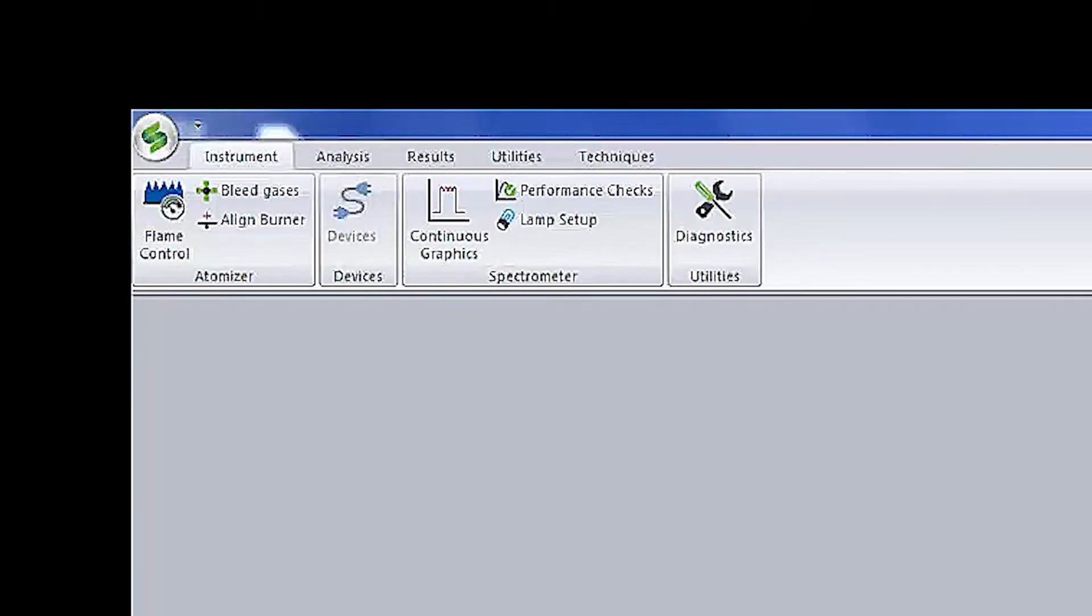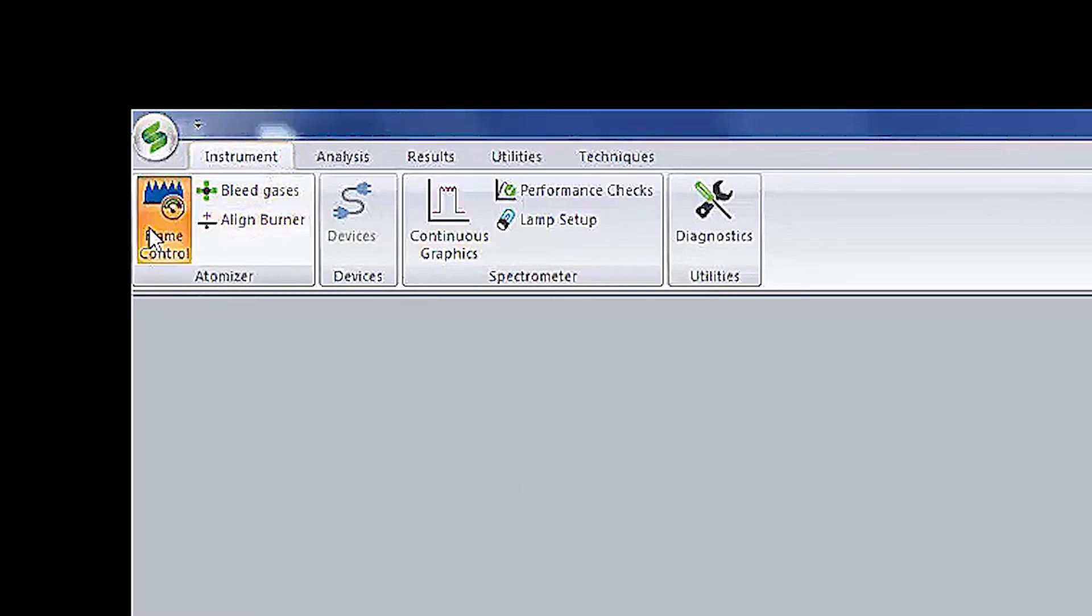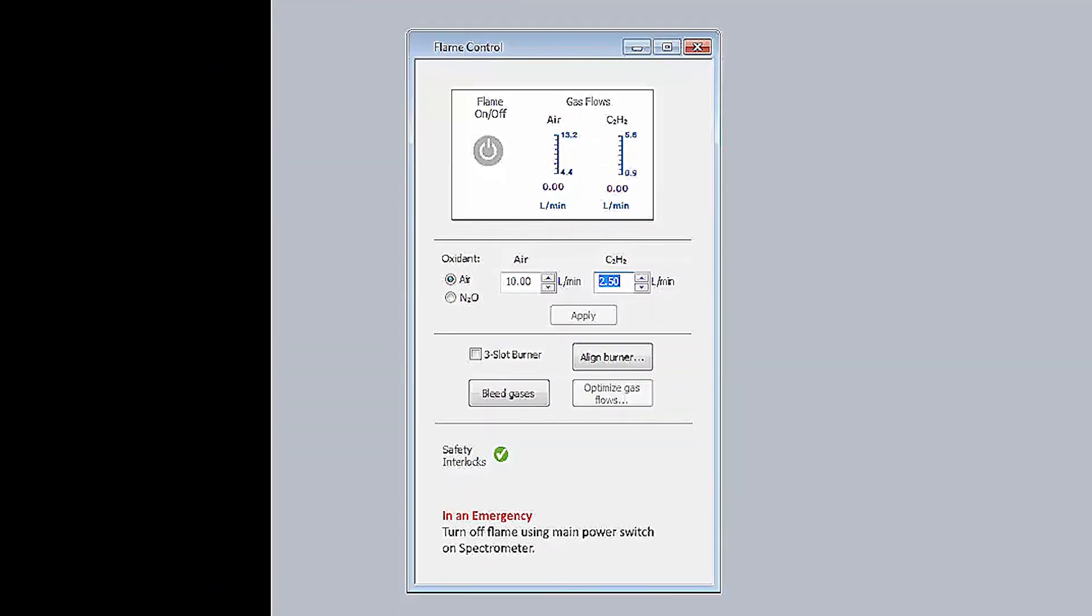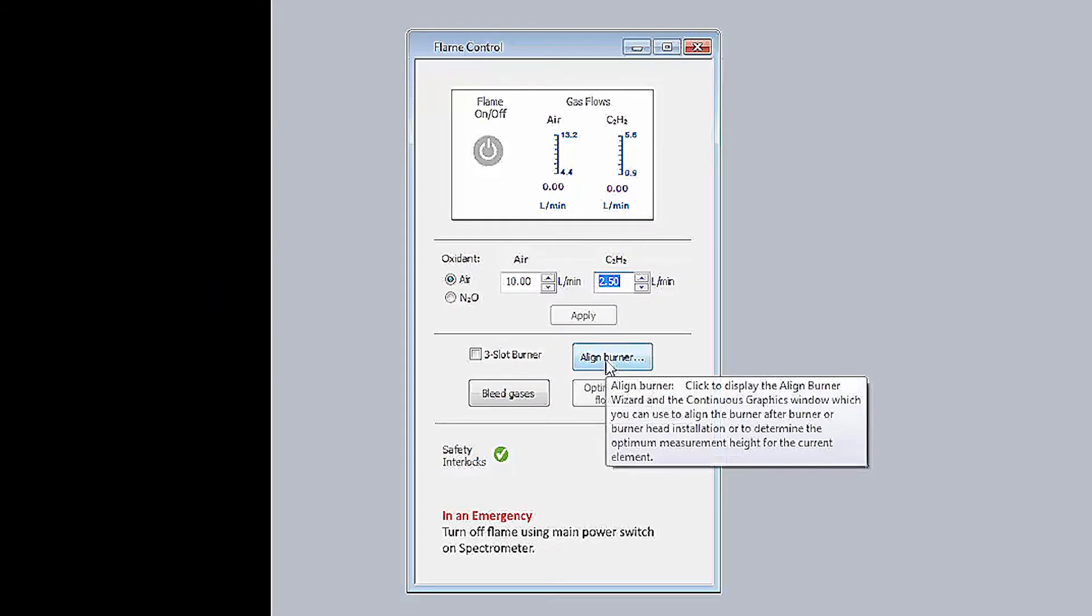Once your lamp is aligned, go to the instrument tab, then the atomizer group and click on the flame control. The flame control window will appear. Click Align Burner.